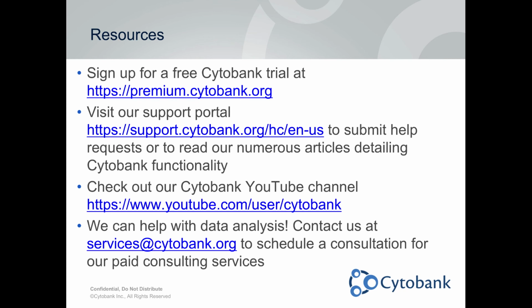Yeah. So essentially these were used so that we could compare the signals from each other. They were well defined, so they've all been run on the machine lots of times. In fact, even before we started running the patient samples, these control samples had already been run several times. So we can see the reproducibility between the samples, but also then we can see any variability. For example, if an antibody were to stop working, it can be spotted at that time. So they have to be analyzed as you go. But then also you have this data set that you can compare over time as well.